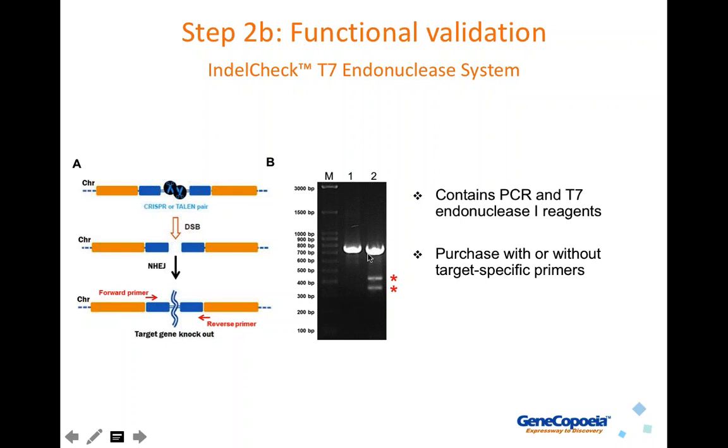And if everything went well, if your CRISPR single-guide RNA worked properly in the cell lines and all the reagents are working well, you will see the presence of 3 bands of predicted sizes. One of these will be the uncut band. This usually results from homoduplex DNA, which is not cleaved by T7 endonuclease 1, as well as 2 smaller, faster migrating bands, shown here denoted by the asterisks. If you see this, then you know that you had a successful CRISPR experiment, and you can go forward with confidence that everything is going to work quite well.